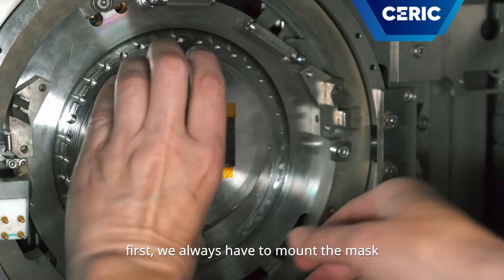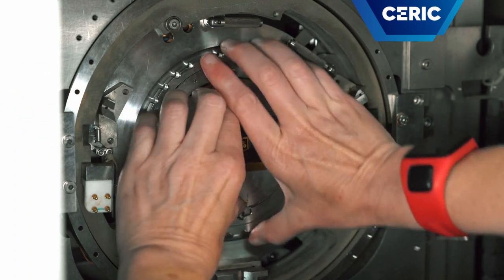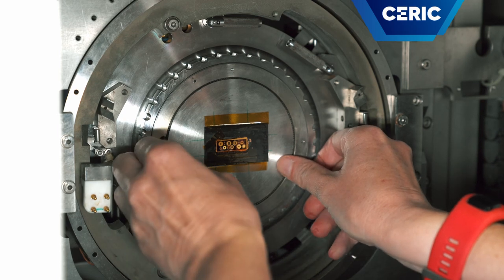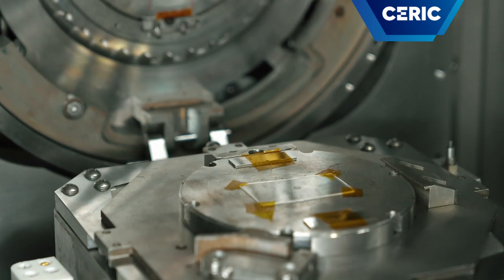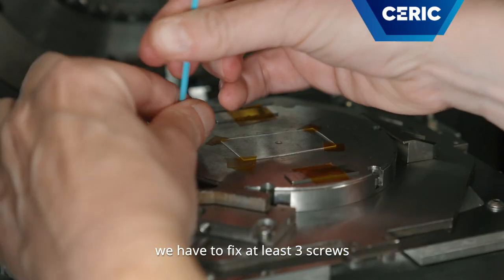First we always have to mount the mask, which is the most delicate part. Now it's fixed. Now we mount the sample in the sample holder. To do this we have to fix at least three screws.